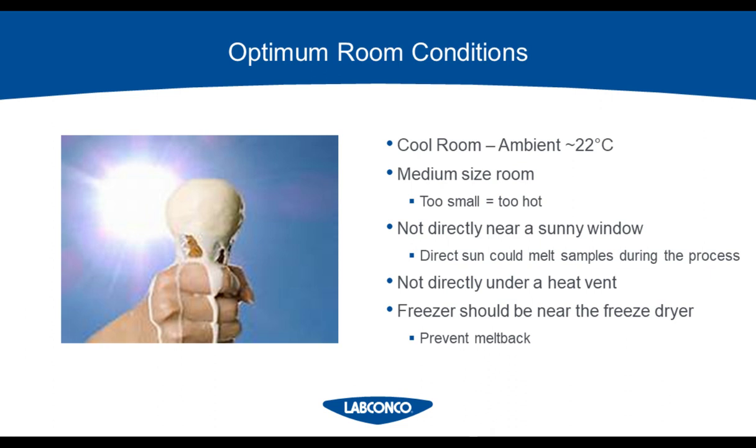You also need to look at your room conditions. A warm room could also create melt back. You want your room about ambient temperature or 22 degrees Celsius for the best conditions. If the room is too small, it could get too hot based on your vacuum pump running as well as your collector running. So a medium to large size room will be better.